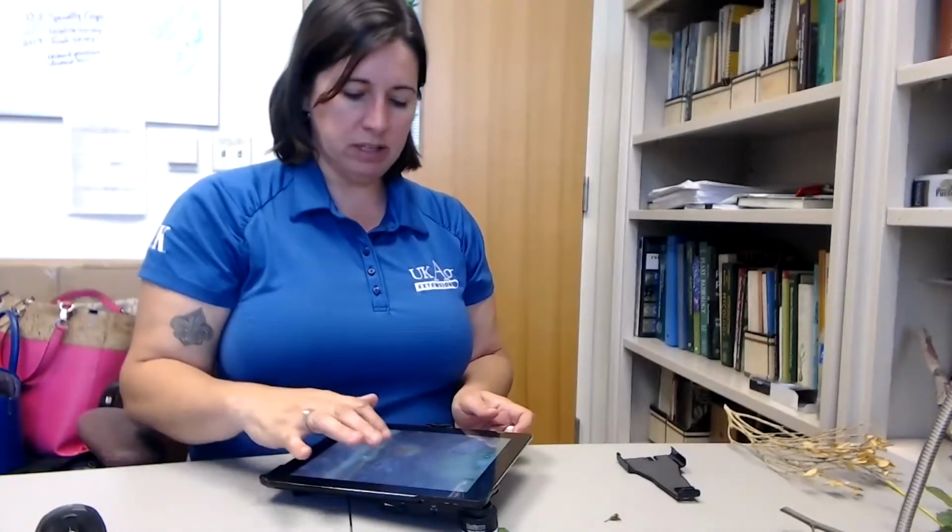I keep moving here. But you're really steadying it here on the desk this way. You're putting your ProScope right on the leaf, and then you are zooming, and then photographing, videoing if you choose, and then you can share it right with us if you need help, like immediately.